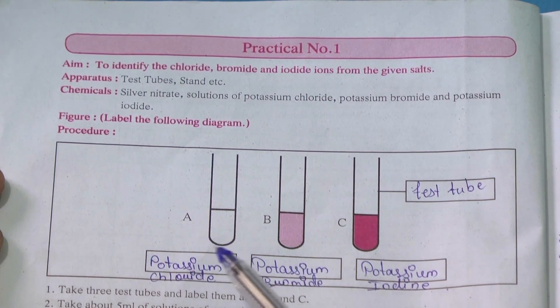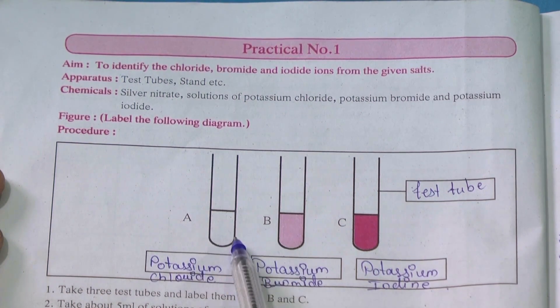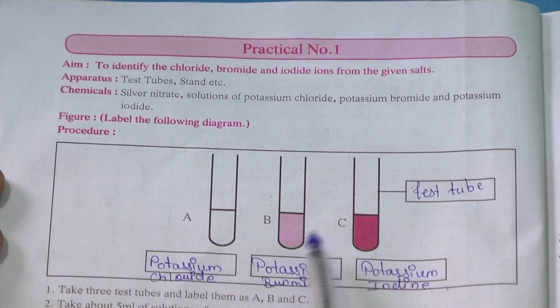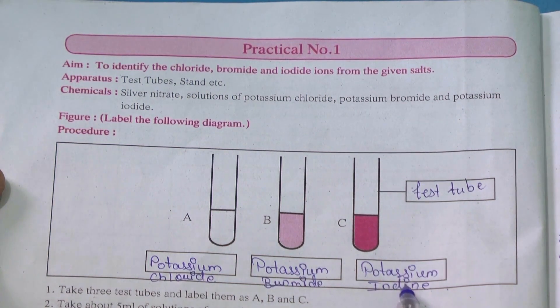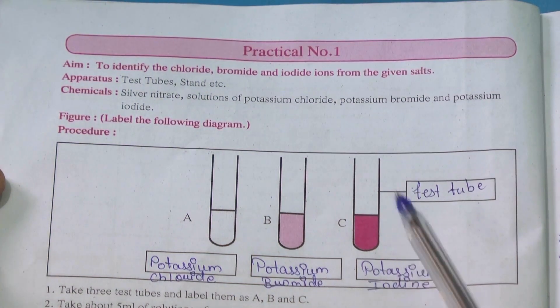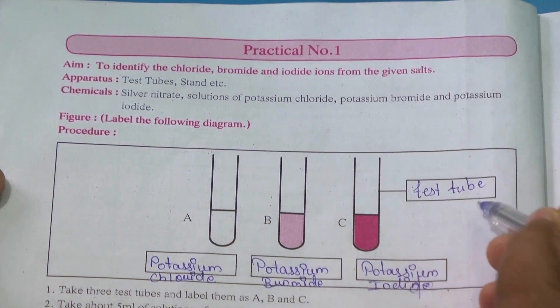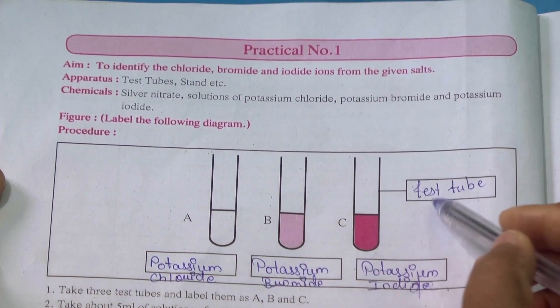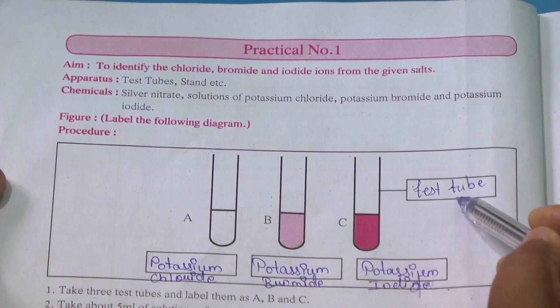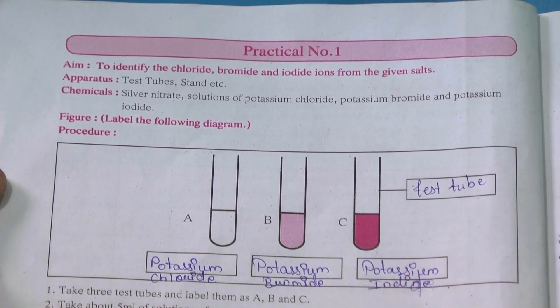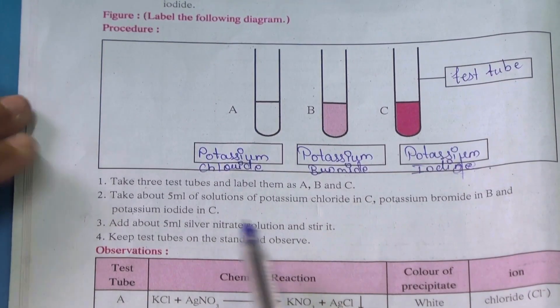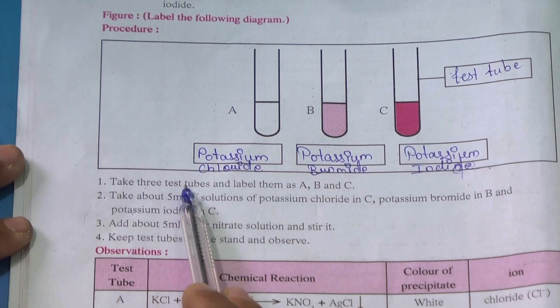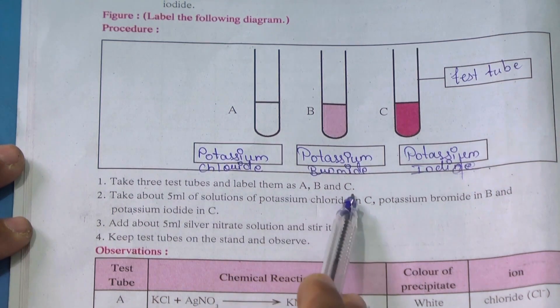The solutions we will be making: in test tube A we will have potassium chloride, in test tube B we will have potassium bromide, and in test tube C we will have potassium iodide. We have taken 3 test tubes labeled as A, B, and C, as per your practical notebook.